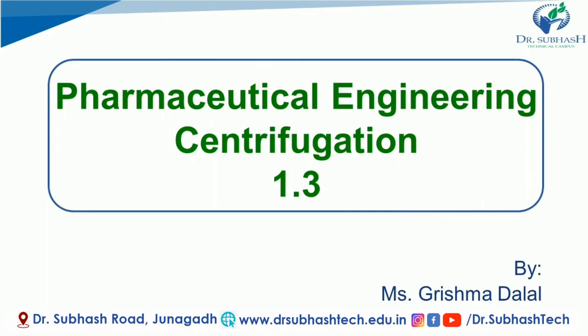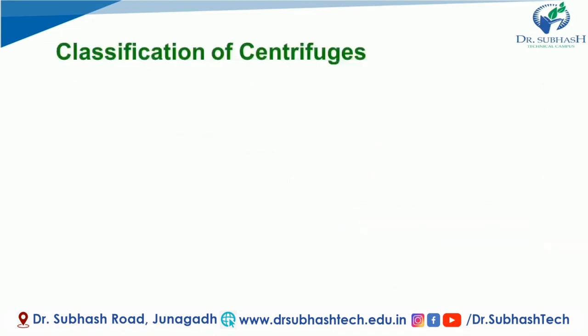Centrifugation 1.3. In this video, we will see some of the centrifuges. If you remember, when I prepared centrifugation 1.1, we studied the definition of what we mean by centrifuge. Centrifuges are the equipment used to separate different solutions or different mixtures. So we are going to see how centrifuges work.